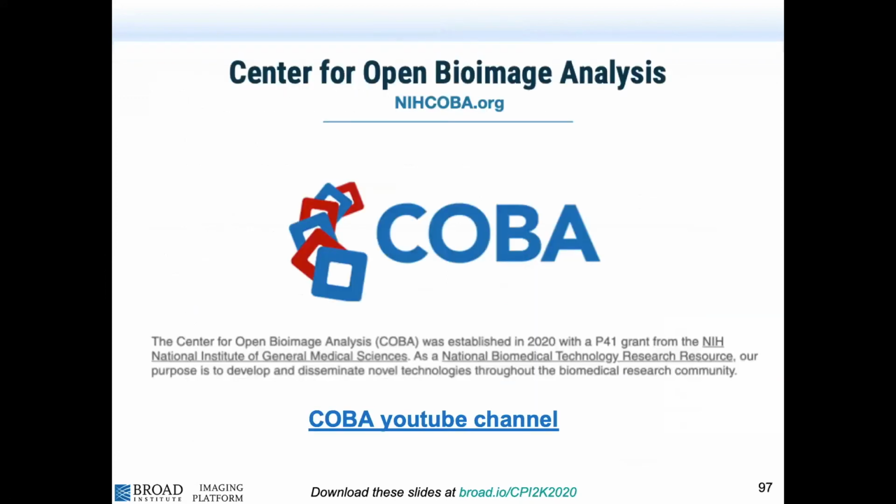It's a great source. And the collaboration of the CellProfiler and ImageJ projects this year led to a center grant for open bioimage analysis, or COBA. The project started this year and the website is up and running, and we started on several projects already.